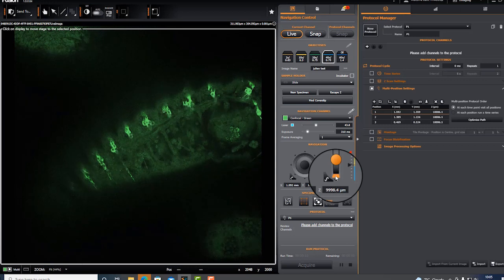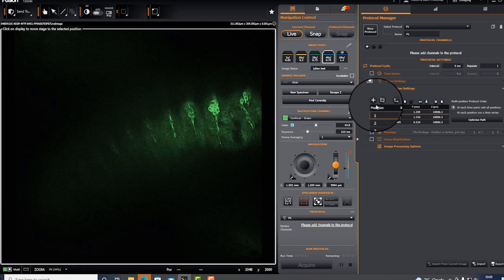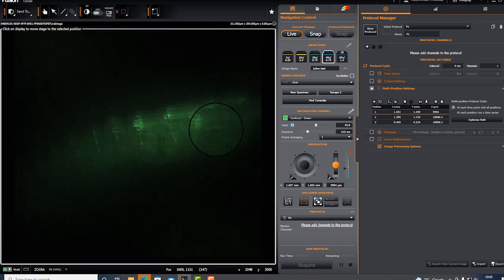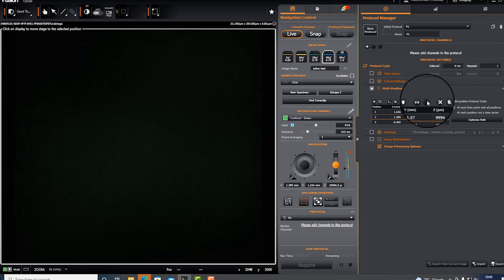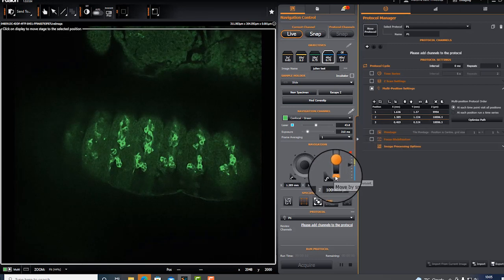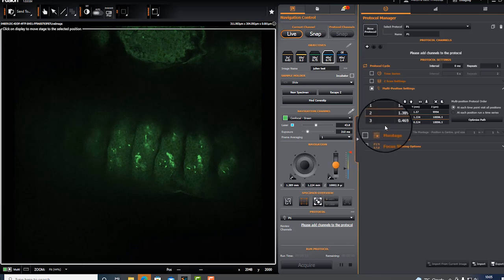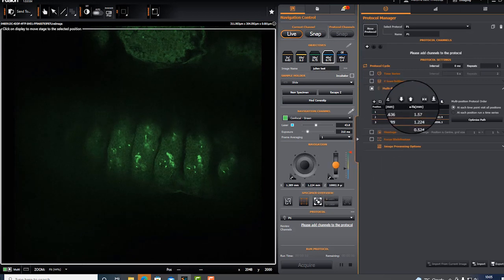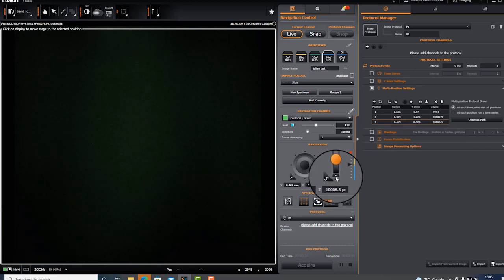So let's just go down and define the start of the position I want. This is the position I want. Well, maybe a bit more toward the center. That's my start. I move to the next position and I go down to define my start. I replace. I move to the next position, which, remember, is a bit farther away.